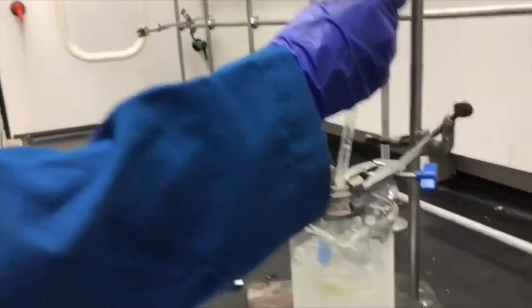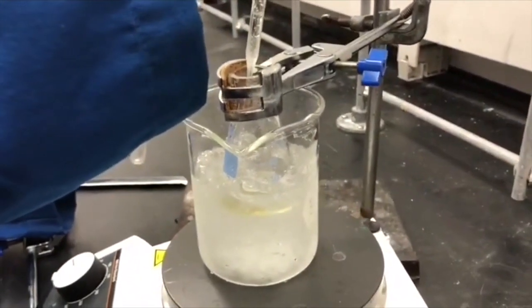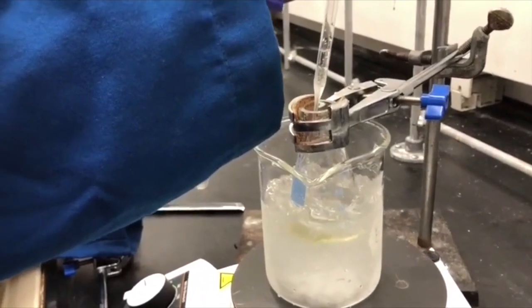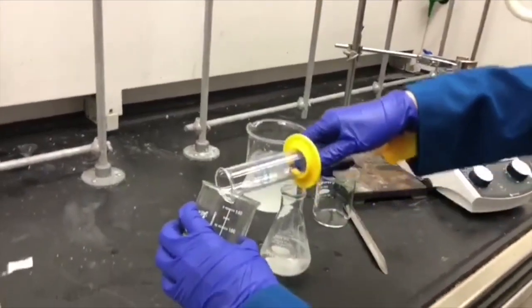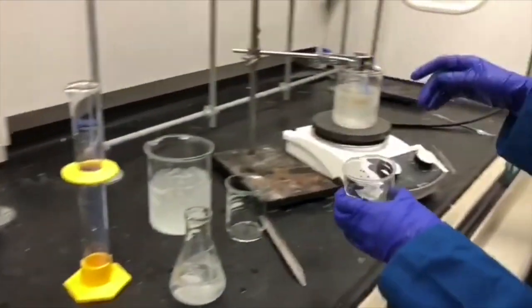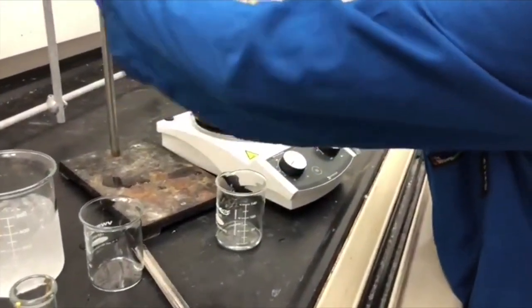Now we add the nitric acid and sulfuric acid mixture into the flask, and if you add it too rapidly, the mixture turns brown and it becomes difficult to purify later on, so you want to add it drop by drop. So here I'm measuring out 10 mL of chilled water. And we're going to add the reaction mixture to that chilled water.